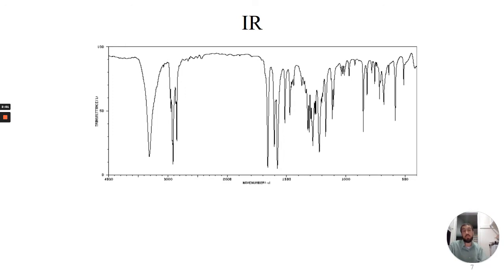I want you to write down everything that you see within this spectra, and I'll try and be silent. 15 seconds left. We'll go ahead and pop it up with a quiz question on what you got.